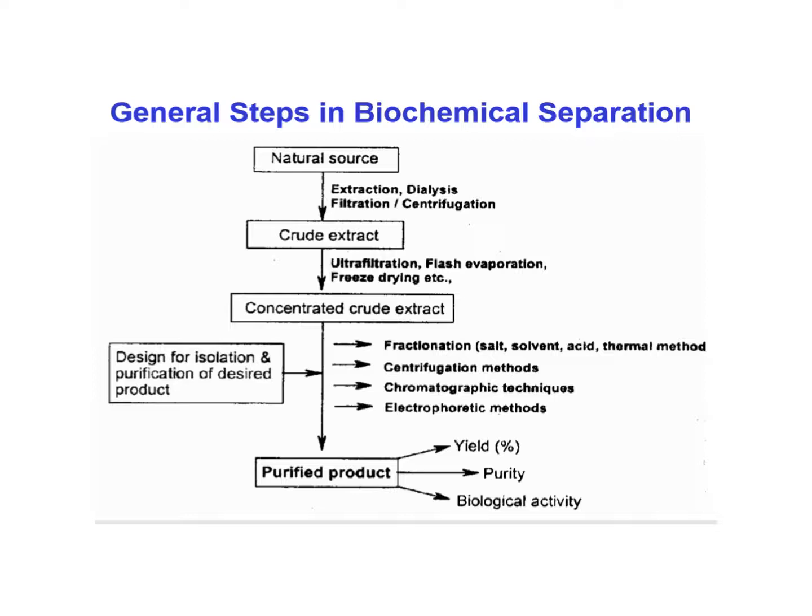We'll talk about protein fractionation coming up, how we actually separate proteins. We will certainly in this lecture discuss centrifugation. We will talk about chromatography techniques and then electrophoretic or electrophoresis methods here. And so we get the purified product.